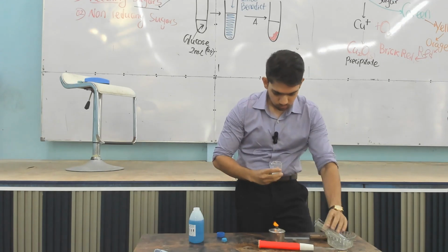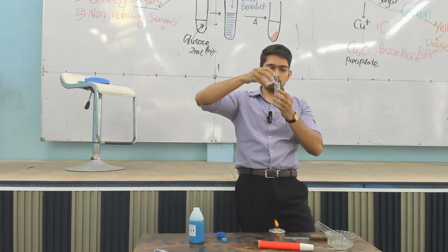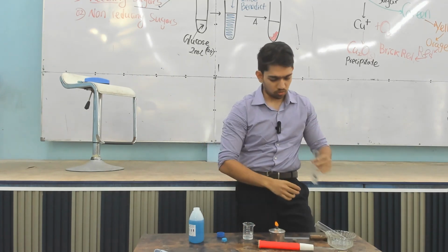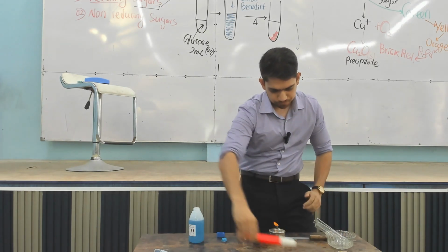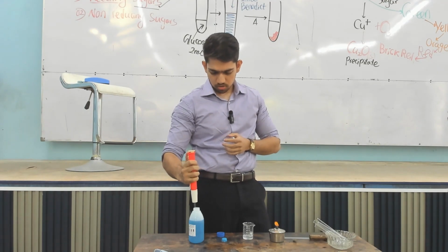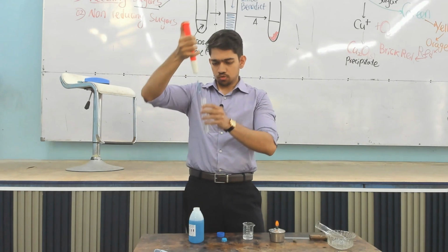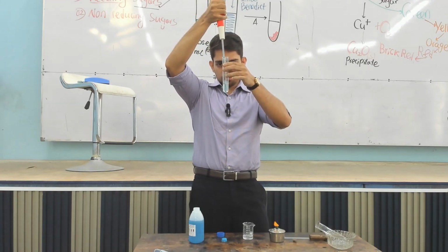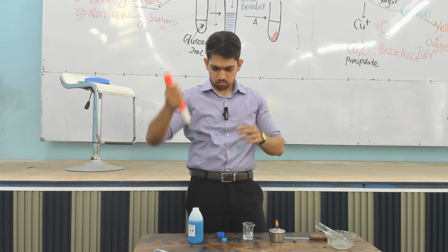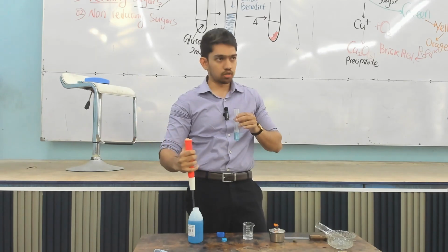So to this boiling tube, we'll add some of our glucose solution. No need to do much measuring, right? We add an equal volume of our Benedict solution, and then we heat. Now people, can you see? So you can see the color of the Benedict, blue color.